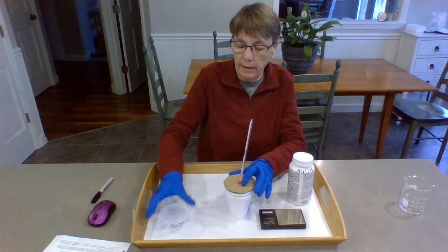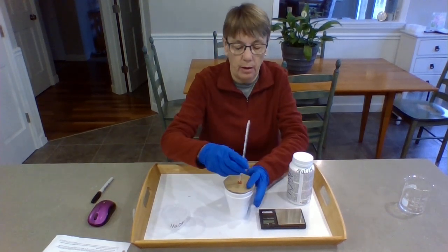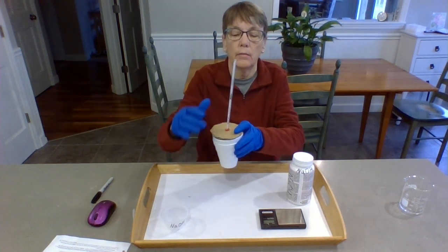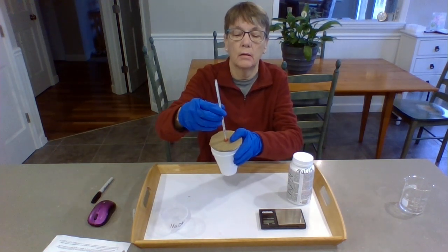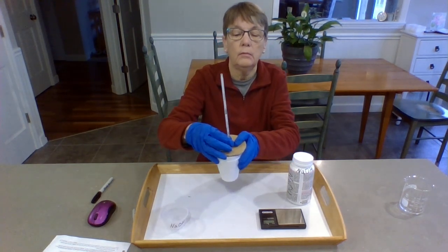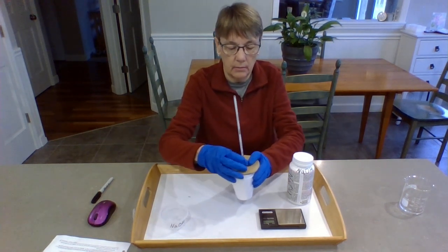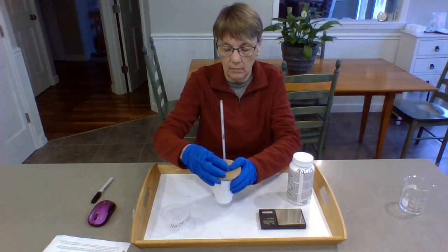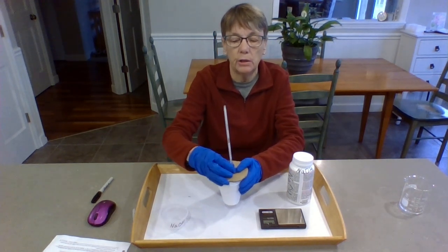A little bit of experimental error there because there's a few grains of sodium hydroxide left in the cup. Okay, so I'm going to use my thermometer to stir it, or just kind of swirl it. It's up to 21 degrees. It's still going up. You're going to learn in this chapter there's 3 ways to determine enthalpy.